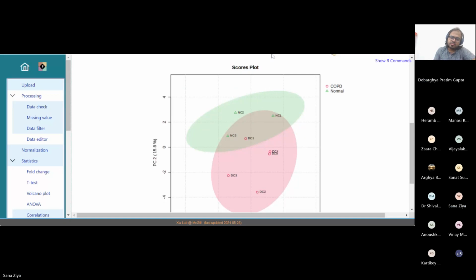I think in your scores plot, the green part was below. Yes, this is one thing which we faced also. Usually this happens if the naming is somewhere different. If you look closely at your plot and the plot I am getting, it is essentially just a mirror image. If we name the samples differently in the Excel sheet, sometimes this happens, but this isn't an issue.